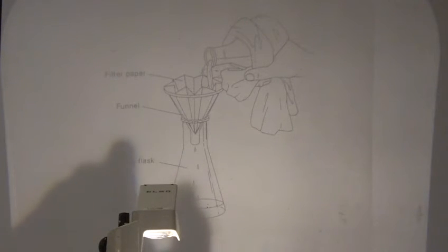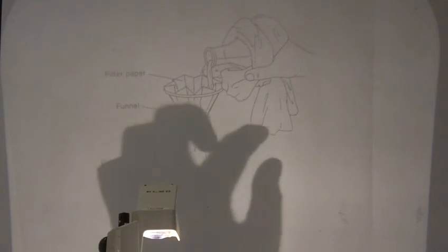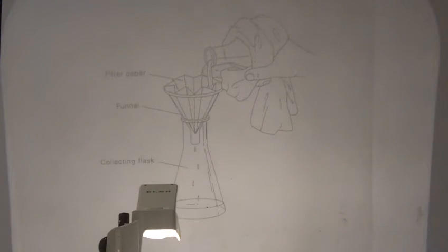But when you're covering things, you're going to want all of this covered while you're filtering, all right? And if you start seeing kind of an off-white solid crashing out on your nutmeg, that's your trimeristin. What we'll have to do is everybody's going to start with 2 extractions. So you're going to stir your nutmeg in the ether, filter it with gravity filtration, put the nutmeg back in another round of ether, stir it, filter it with gravity filtration.